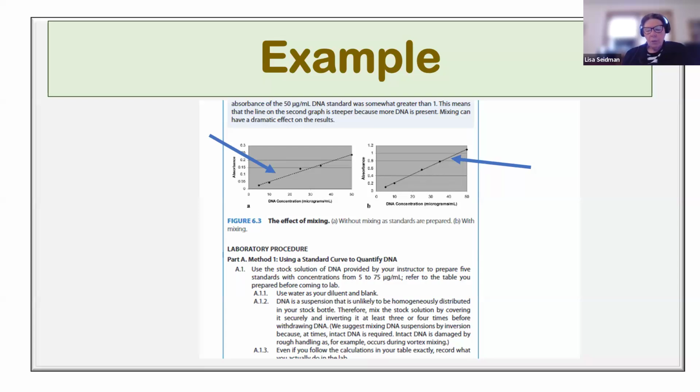So this is the kind of thing we want students to understand. There's a lab where they take the Biorad protein assay kit. They just take the kit and they do various things to try to mess it up. So they might try, what happens if I put in too much protein? What happens if I put in too little protein? What happens if I throw in detergent? So they do various tests to try to verify and understand how that assay works in their hands.